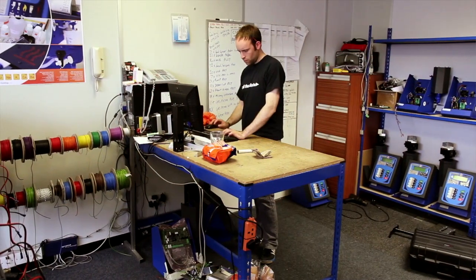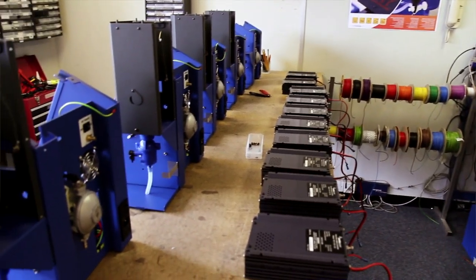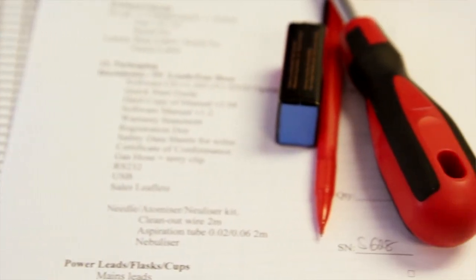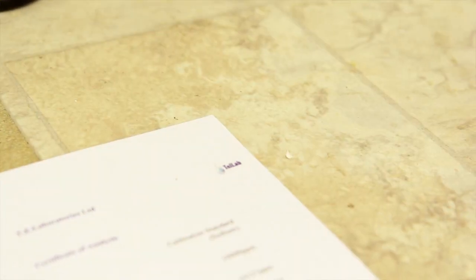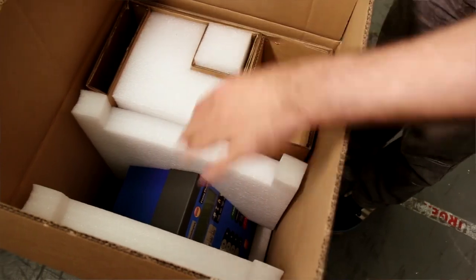It's really important that the units perform consistently every time and give the accurate results that the customers are after. Testing starts by checking the nebulisers. We run a calibration check across all five ions. Every instrument has a 72-hour burn-in, intended to weed out any problems with the electronics. We've got checklists — we check every nut and bolt for the right amount of torque, for the right tightness. When one of these items goes out the door, we're confident that every one is as good as the next one, and every one is the best quality that we can manufacture.